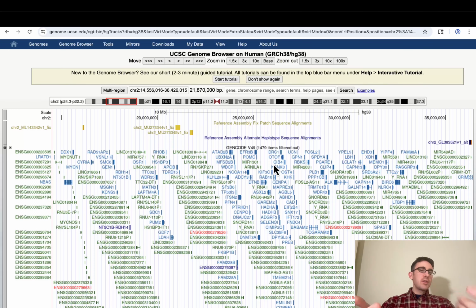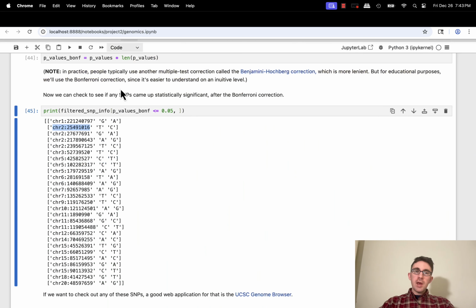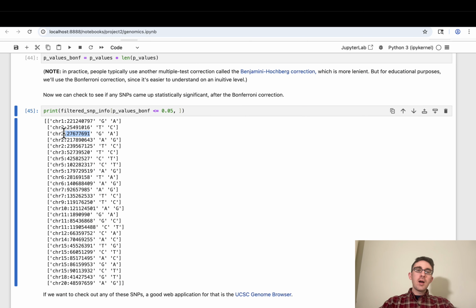So anyway, this whole exercise of zooming out was just to really emphasize how little of the total DNA sequence is the exons that are ultimately coding for the amino acid sequence in the protein. Okay, maybe I'll show you one more example and then let you continue on your own after that. Let me do one more example for you.